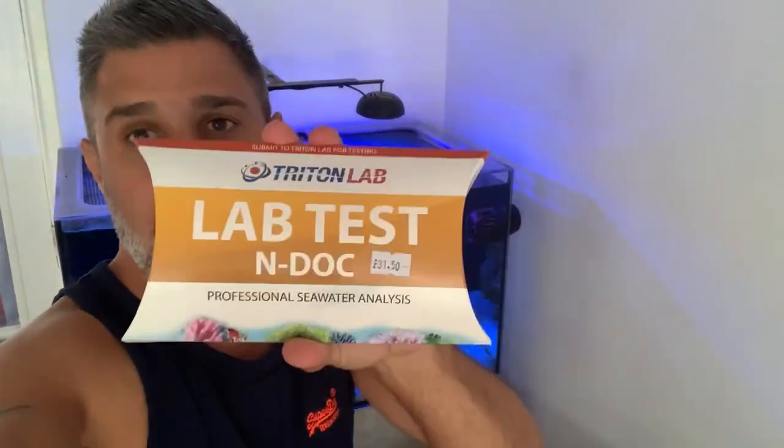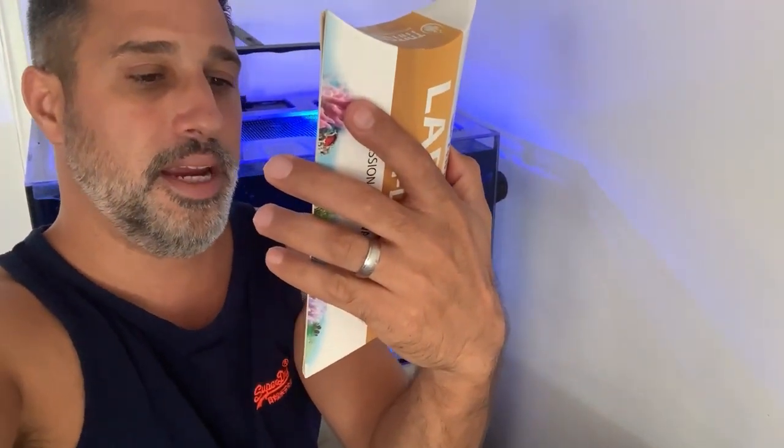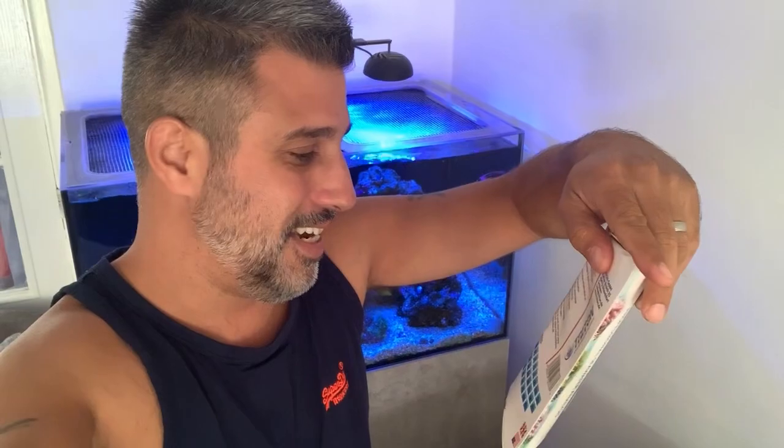We've got the Triton lab test N-DOC test kit, which tests alkalinity, nitrates, NO3, and DOC — dissolved organic carbon. I've never done one of these before, so I want to see what the results are. We're also doing the standard ICP test, which we've done on the channel quite a few times. It tests for pretty much every metal you can imagine.